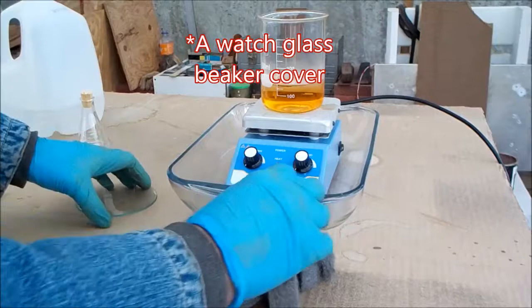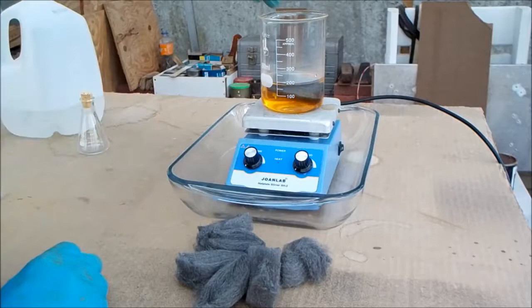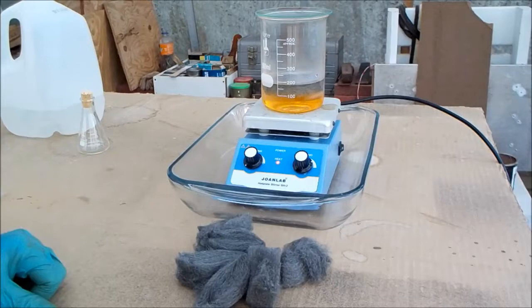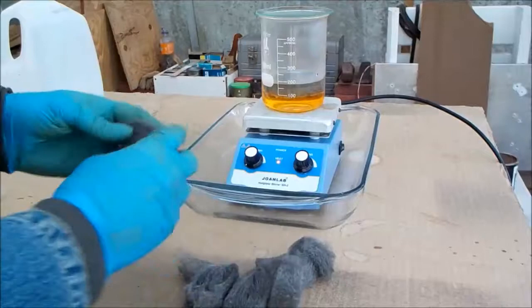So I'll start off with just one piece that I've cut off from the larger pieces of steel wool. Throw that in. And I will turn on some heat. This should be self-heating once it gets going, and then once it gets closer to completion, it may need additional heat as well. As you can see, it's already starting to bubble. It doesn't look like it's going to get out of control, so I will add a couple more pieces just to get this done.